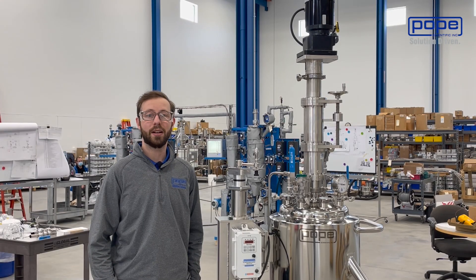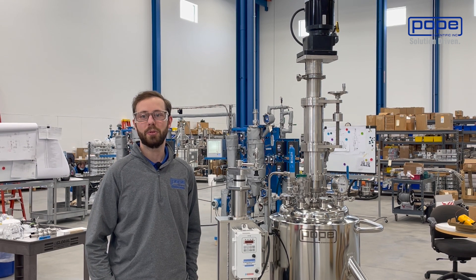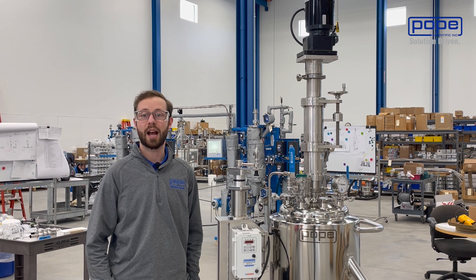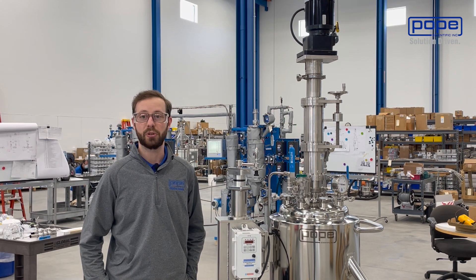Overall, the Nuche filter dryer is very beneficial because of its versatility. The many unit operations that you can do in one single vessel eliminates the need to transfer any material. This becomes very important when you're making high purity CGMP products, where the source of contamination can be that simple transfer.